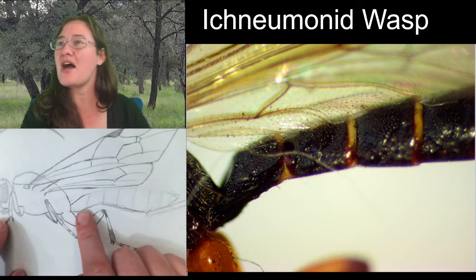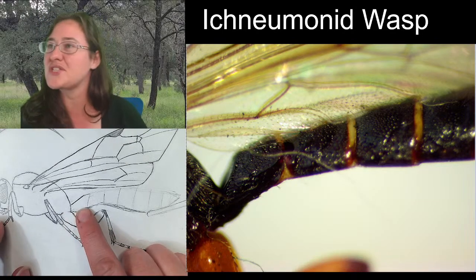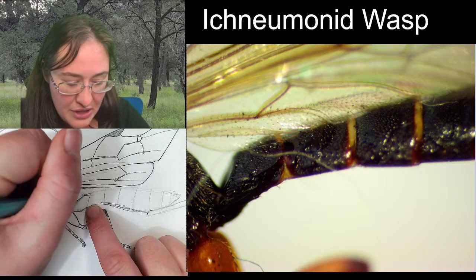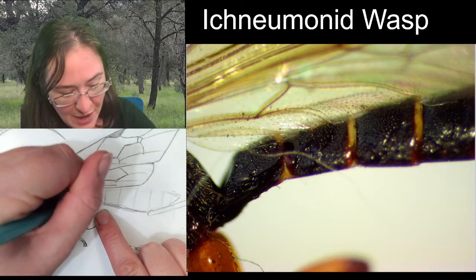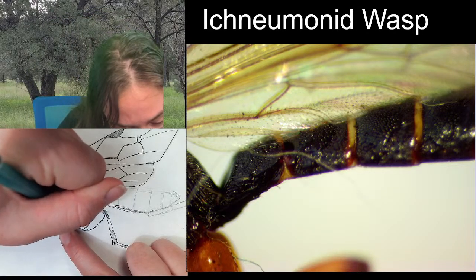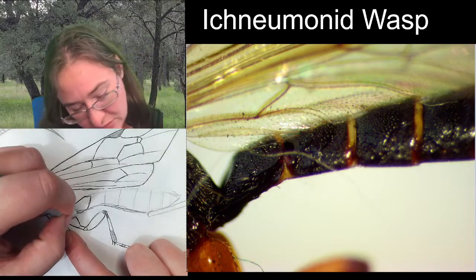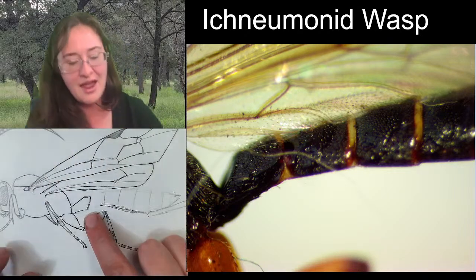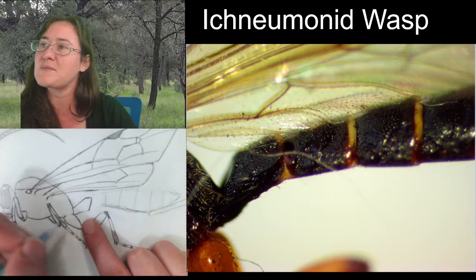Alrighty, so I'm going to go ahead and start with this first abdominal segment. You can see that there's that strong angle here and then here, and it comes back down and around. Something like that. All right, so I've got my first abdominal segment taken care of.